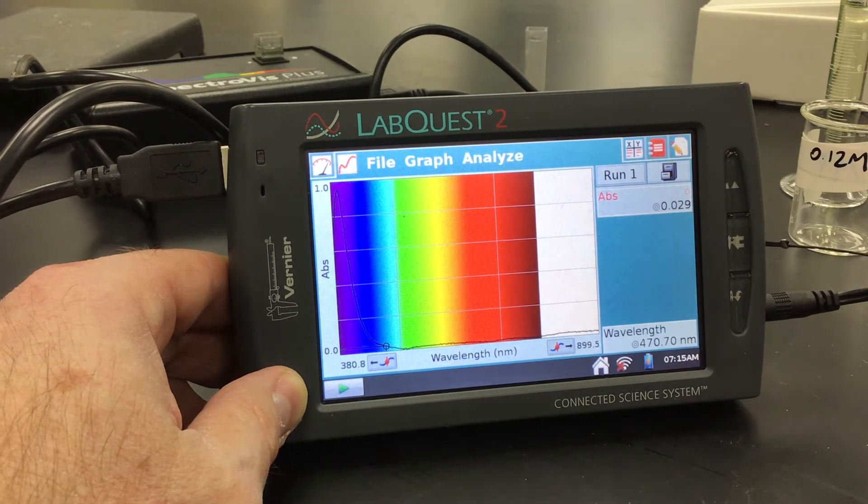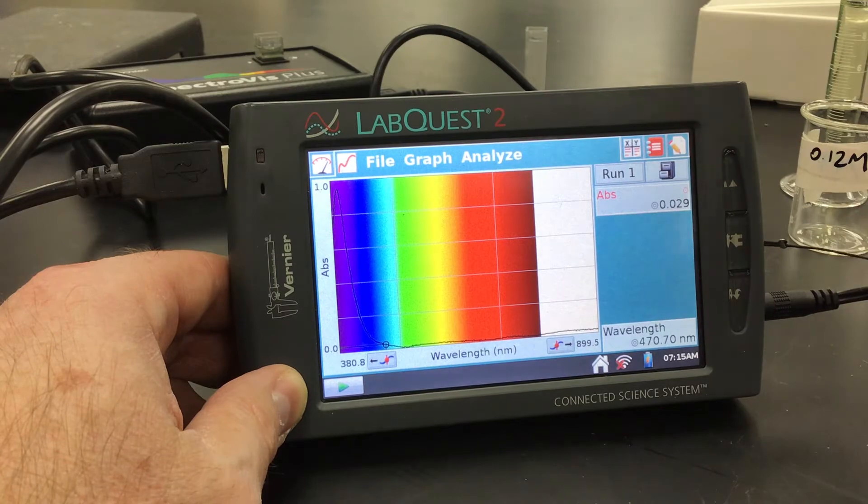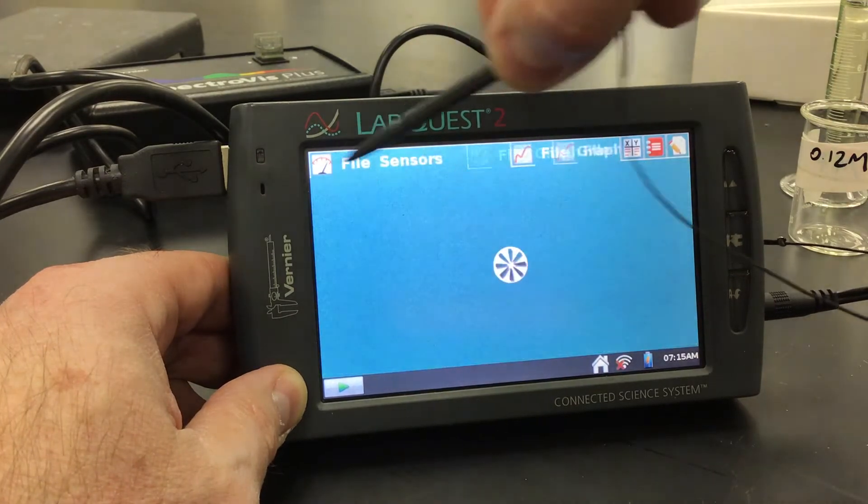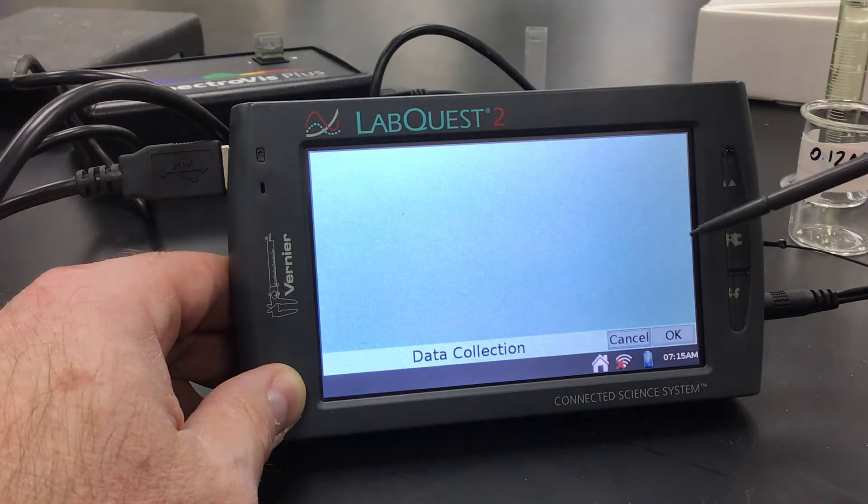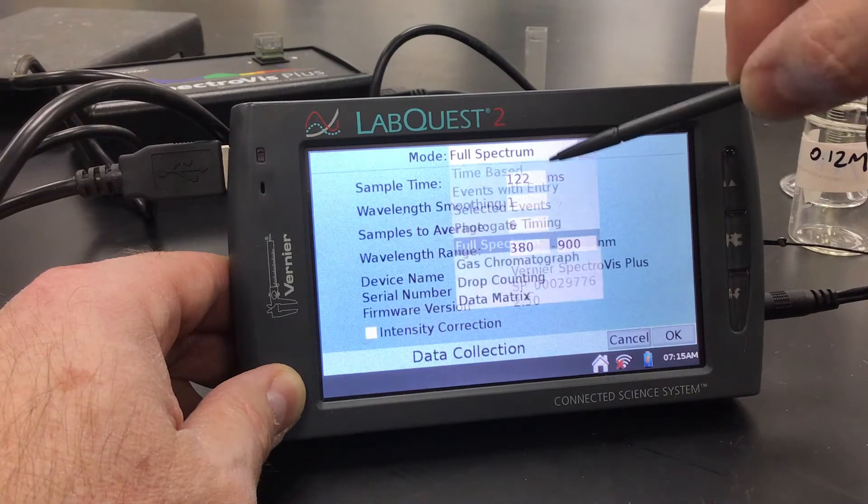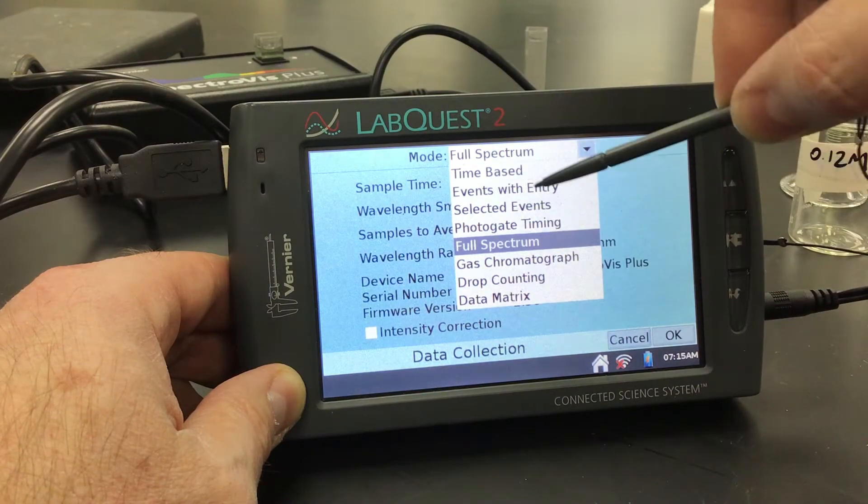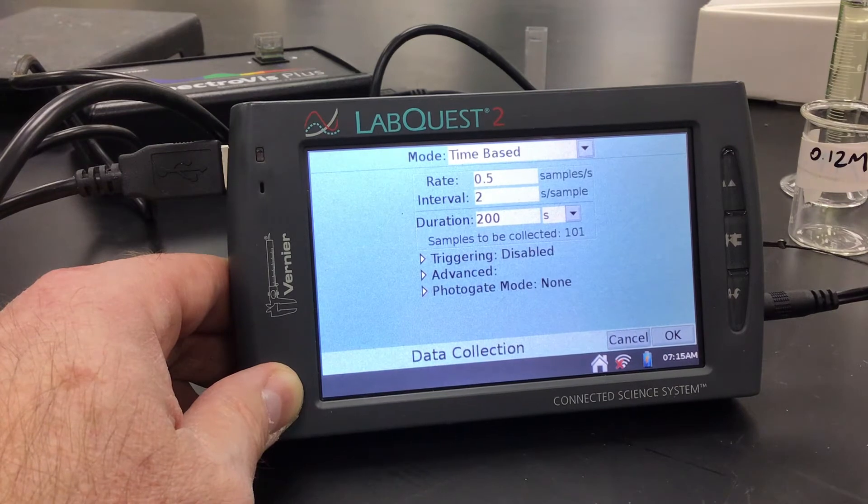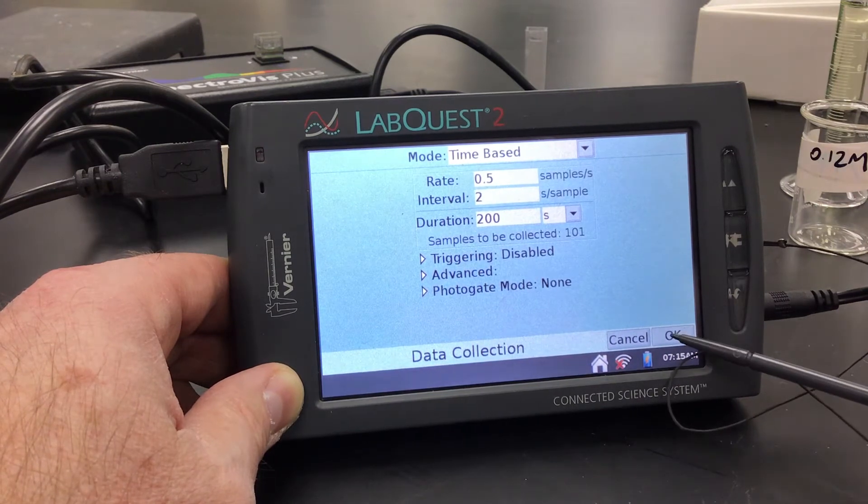Once we can do that, we're going to go up in the top left into the meter and we're going to change the mode to time-based. And then our time-based, we're going to collect it at 200 seconds, which is the default. All the other settings look good, so I'm going to hit OK.